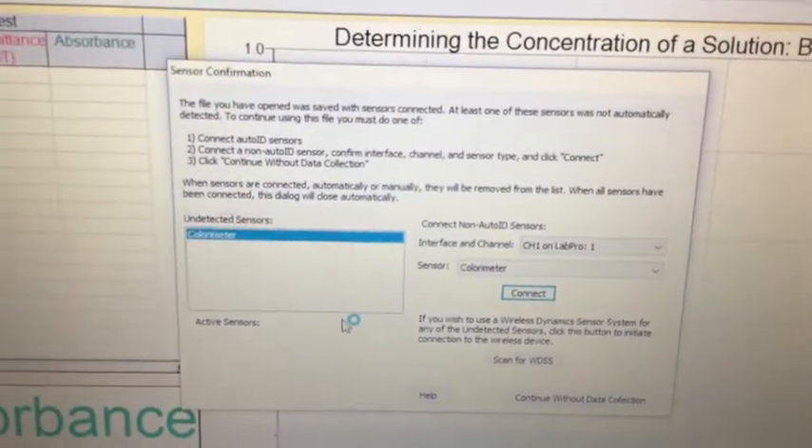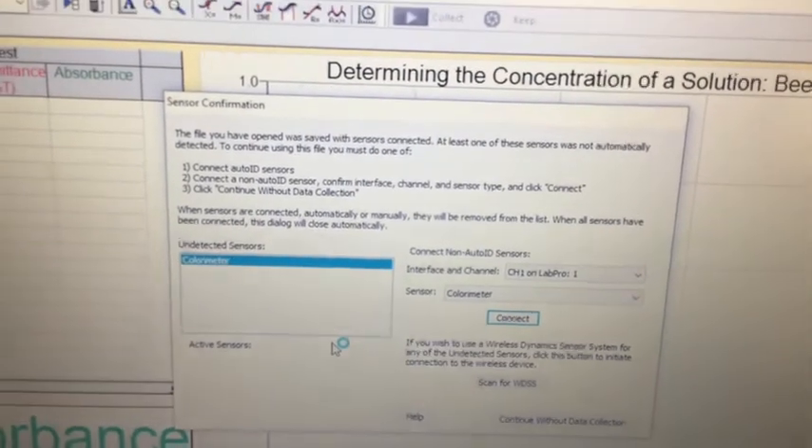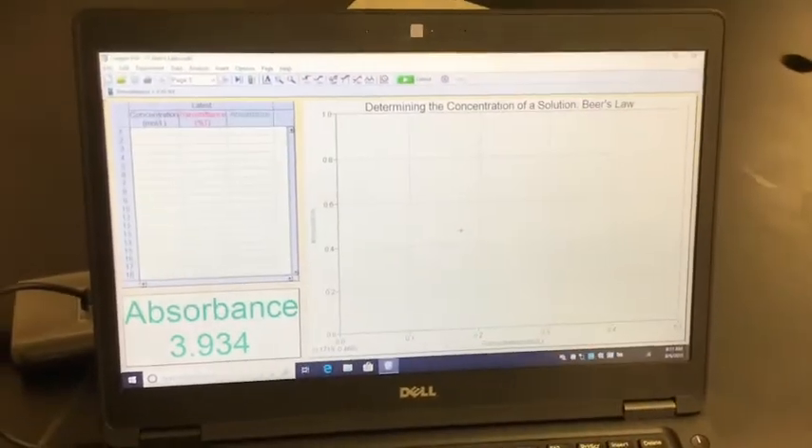Now it's going to ask you to connect. Here we are at the sensor confirmation screen. It says it thinks it's a colorimeter, and you confirm yes, it's a colorimeter. All you have to do is tell it to connect that device, and now we are connected.